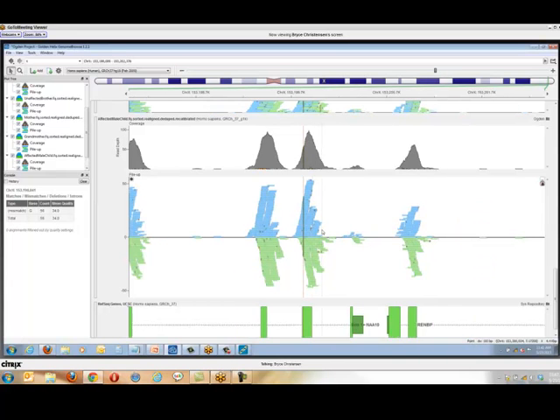So that was the 25-minute start-to-finish analysis that we all dream of being able to do, right? We all wish that everything was that straightforward: starting out with about 100,000 variant sites, narrowing it down to 8 candidates, and having one really jump out as the obvious one. It doesn't always happen that way. Any questions about what you saw here?